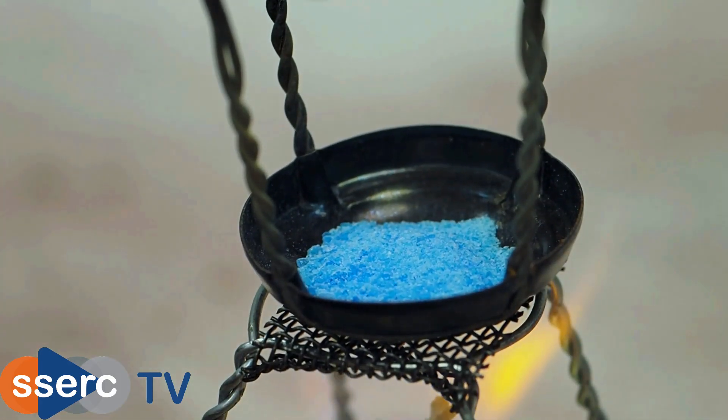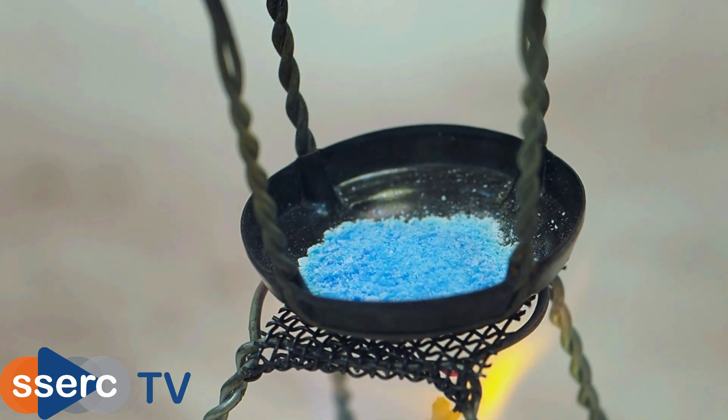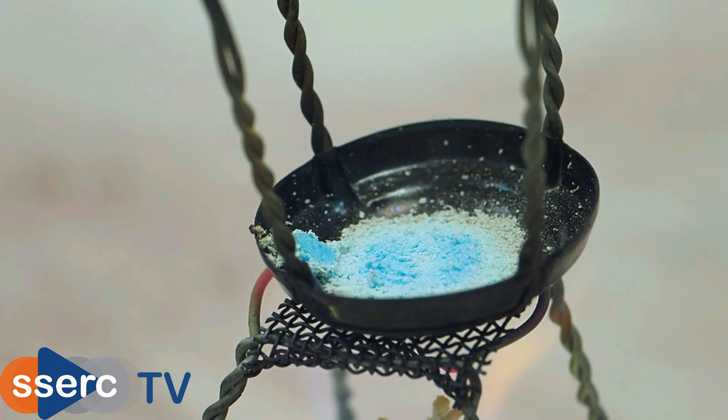Now heat your crucible. We're just using a small spirit burner, but you can just as well use a Bunsen burner, though you'll need to be careful not to heat it too strongly. As you can see, quite soon the copper sulphate starts to turn white, particularly around the edges.